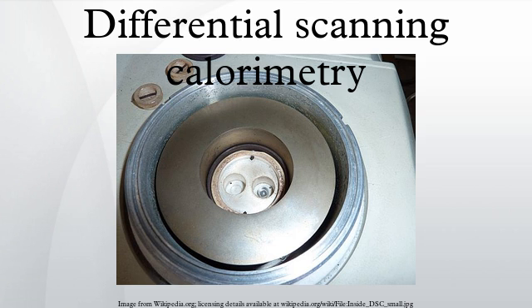Applications. Differential scanning calorimetry can be used to measure a number of characteristic properties of a sample. Using this technique, it is possible to observe fusion and crystallization events as well as glass transition temperatures (Tg). DSC can also be used to study oxidation, as well as other chemical reactions.